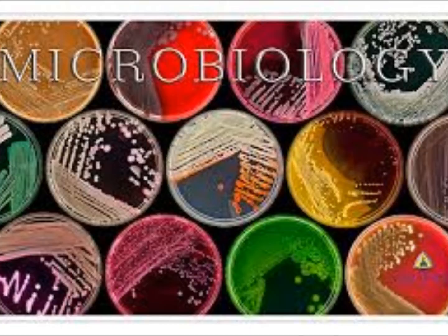Like Jean pointed out, you're not always gonna use these descriptors, but for example, the one that's concave, strep pneumo, they call it the donut shape. Strep pneumo will be concave in the center. So if you see an alpha colony with a concave center, you wanna make sure you notate that, because that is telling the tech a lot.